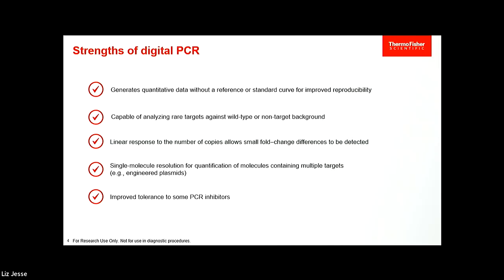It's also good if you are trying to discern a low fold change. If you have minimal fold changes, but you're not sure if they're significant, in relative quantitation, you wouldn't have the ability to discern a low fold change of, say, less than 1.5 or 2-fold changes.